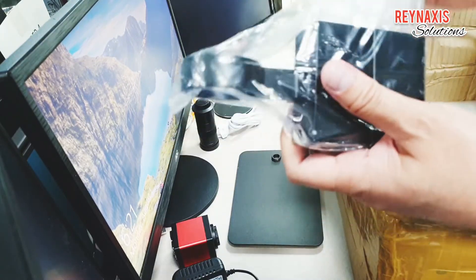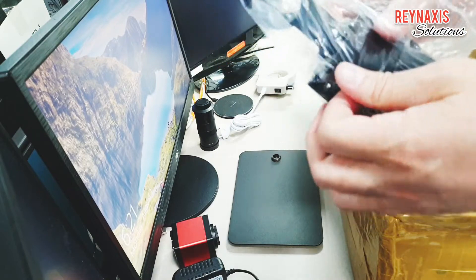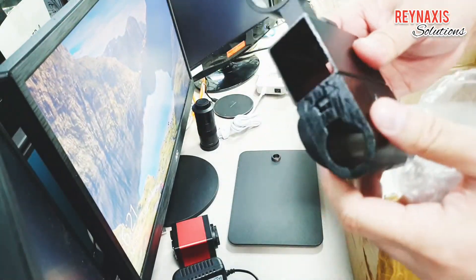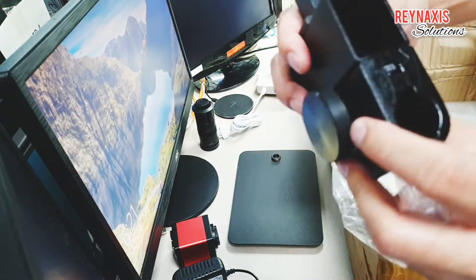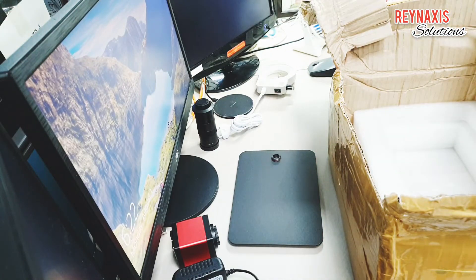Here is the holder for the digital microscope. It is made of pure metal — there is no plastic in it. It is also very heavy, so be careful if you drop it as you might damage it.